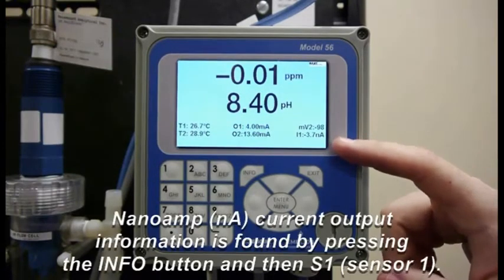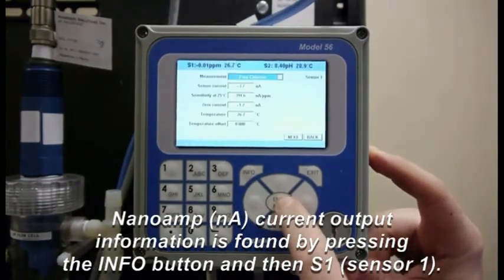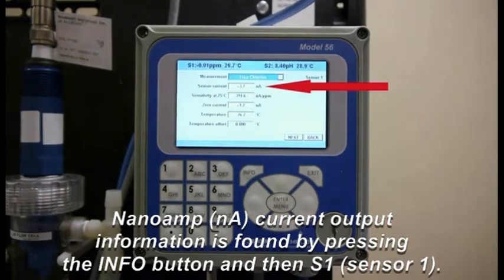If you have a different model, I'll show you how to get to it. You're going to go to Info, you're going to go to Sensor 1, then you're going to need to find the sensor current.